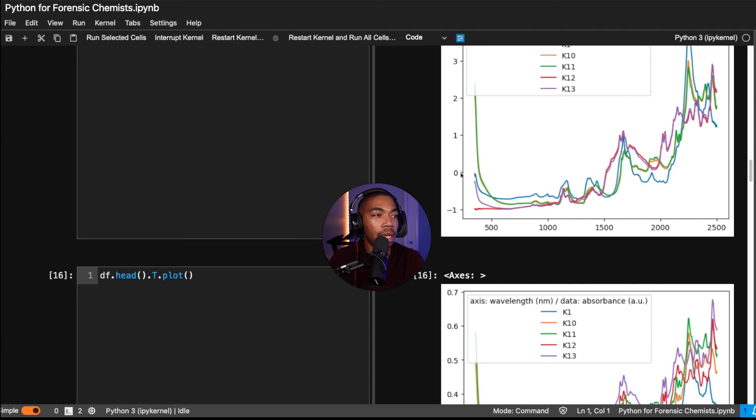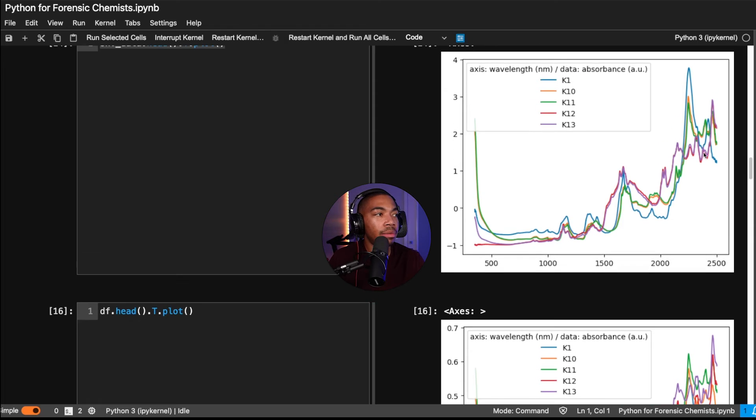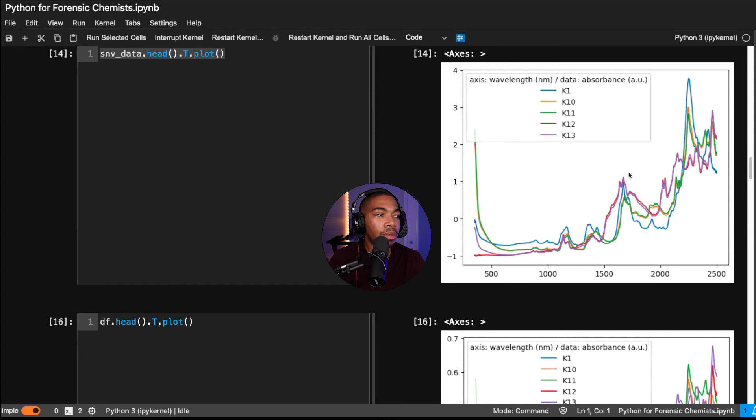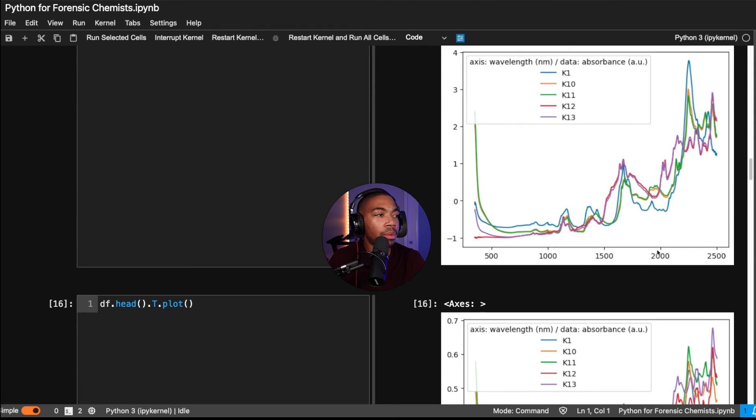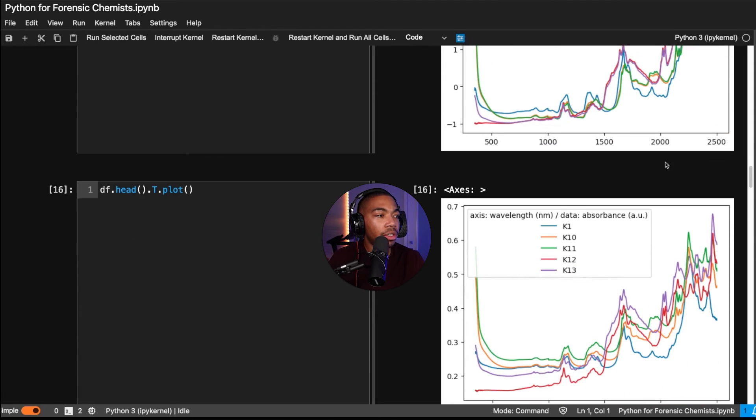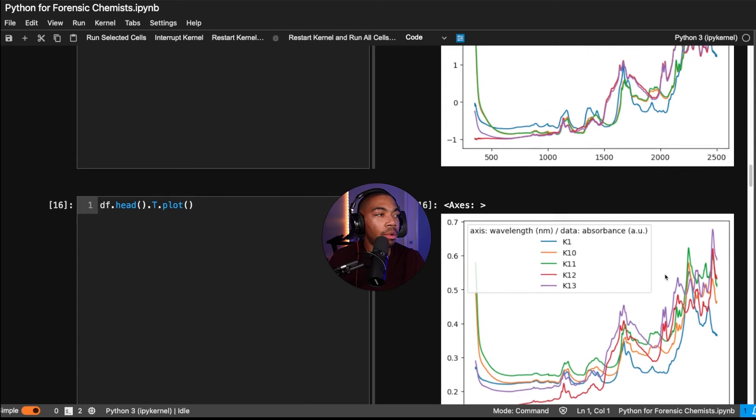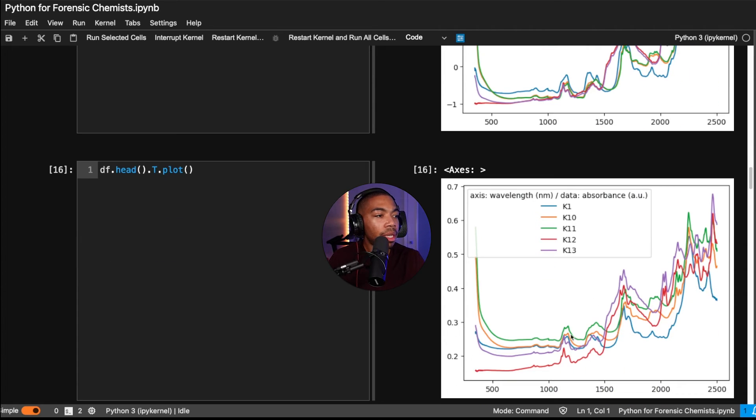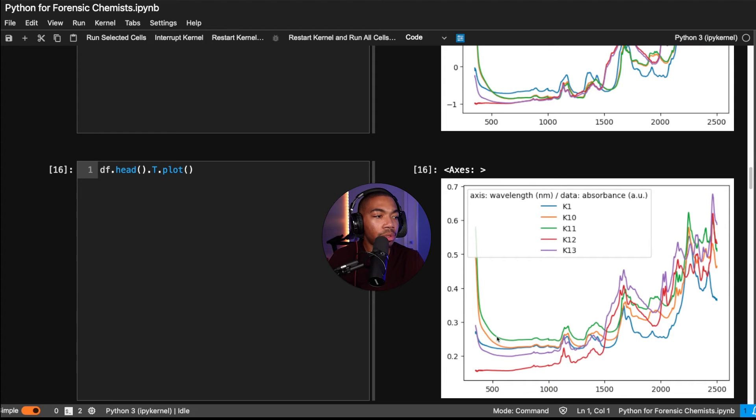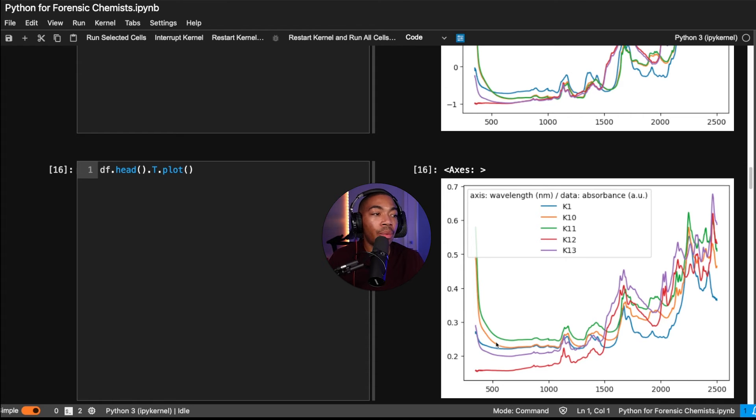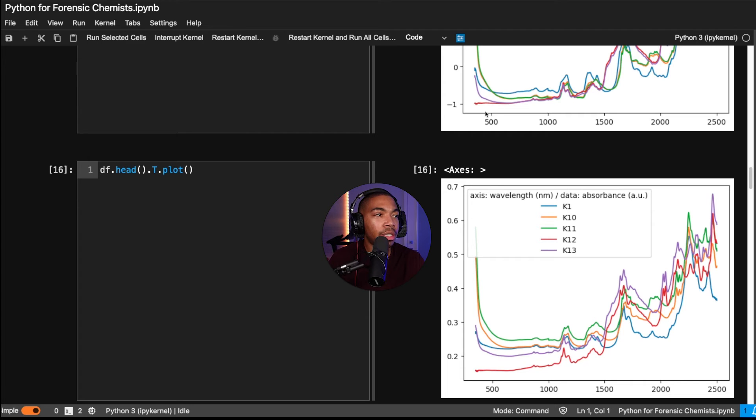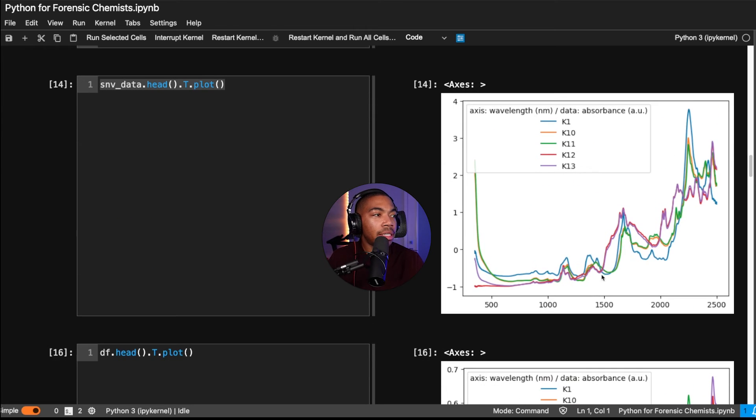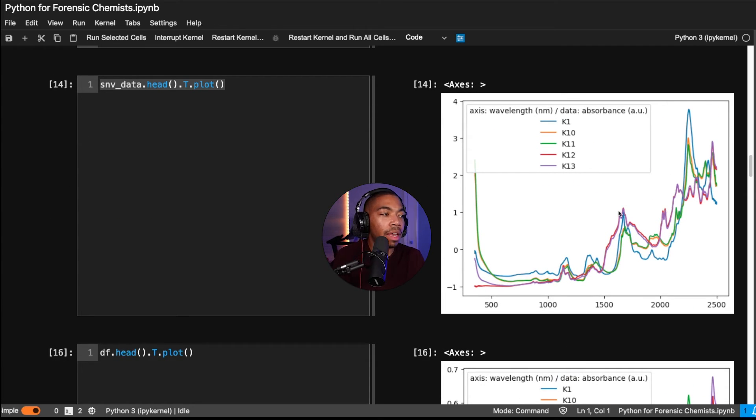We can also see that some of the smaller features become way more distinct. Something else that was a little obscured is that the green and orange traces are pretty similar to each other, but we have this scattering effect in the data. Again, this bottom trace is the one that was not processed. And again, here we see that the purple and red traces come together quite a bit, and here they remain apart. So you can kind of see the impact of this preprocessing.